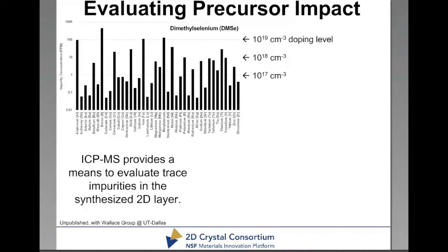That basically breaks apart all of the ablated material from the laser, forms ions, that get brought into a quadrupole mass spectrometer, and everything gets separated by mass. Right? And from that, we're able to then identify what some of the original materials were, the original elements, etc., that were coming from our film after we've grown it.